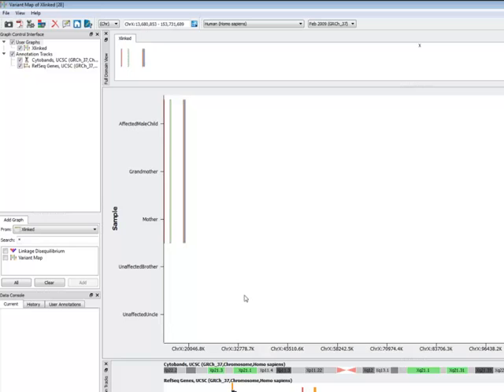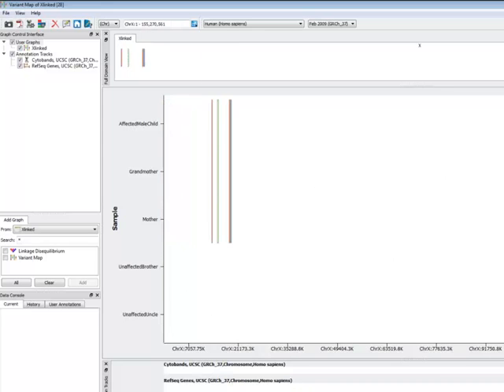But it is nice to just look at this even and see, looks like I have two chunks of the X chromosome that are segregating from the grandmother to the affected male child and not through the other lines. My background in genetic epidemiology is such that I like to look for things like this. If I saw things all across the X chromosome being passed through, I would really question it.